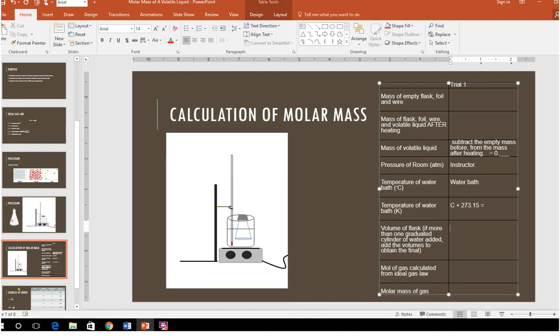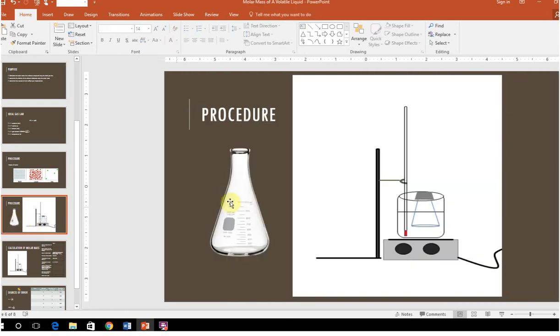Now, the volume of the vapor is a little bit more tricky to get. You guys remember back in lab one, you took an empty beaker and you measured the height and the width. And you did a calculation to find that the volume of that beaker was different from what was printed. So technically, we could do a calculation here, too. But this is a conical shape and then a flat shape. And then you have this little area down here. It's just too complicated.